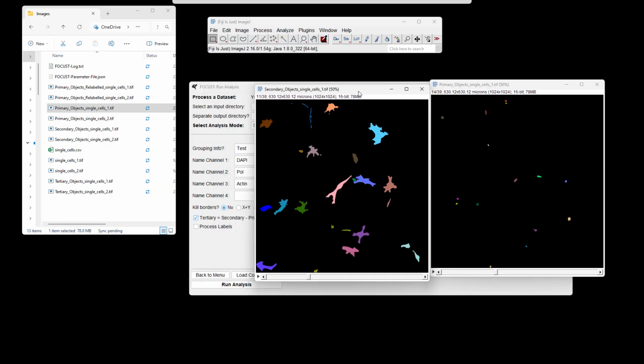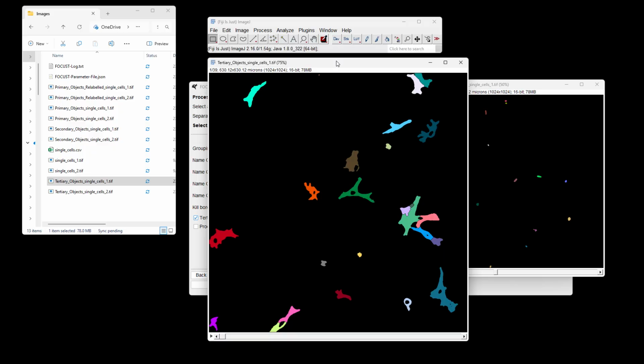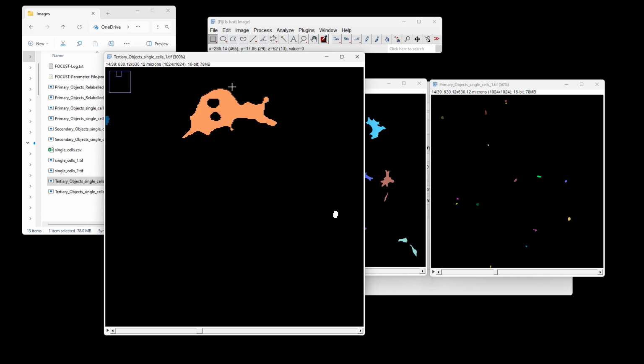We have found a cell with 2 nuclei. Again, whether that's biologically relevant or not, we could load up our original image and have another look. But we'll notice our tertiary image will also reflect this discovery in that we have 2 absent nuclei from cell number 3. So we have nucleus number 3 and 3.1 sitting inside this space.